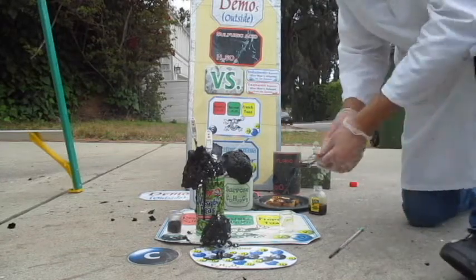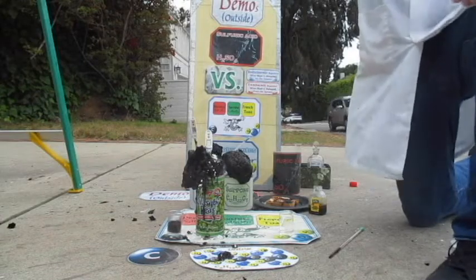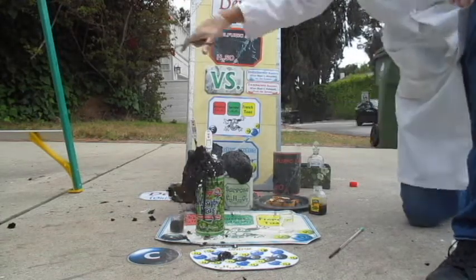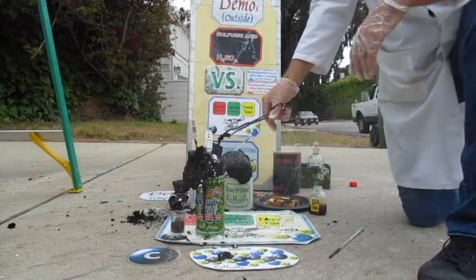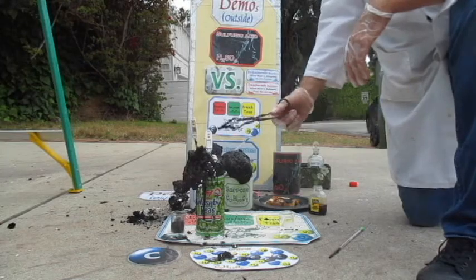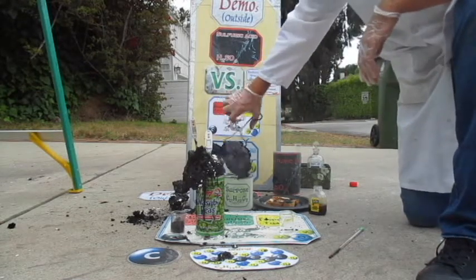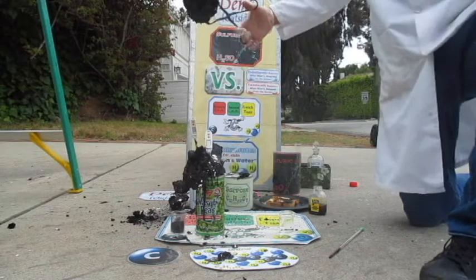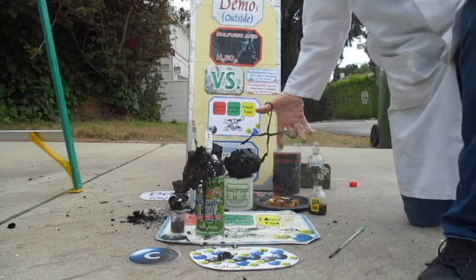So notice this carbon monster, I'm going to smash it on the ground. Watch. It's a carbon monster. And look at that. Why is it so fluffy? Because it's full of all the bubbles where the air went in. Okay, when the steam was coming out, it frothed it up like a foam. So that's why this is so light. It's very, very low density. And how can all this come out of there? Because it's been frothed up, that's why.